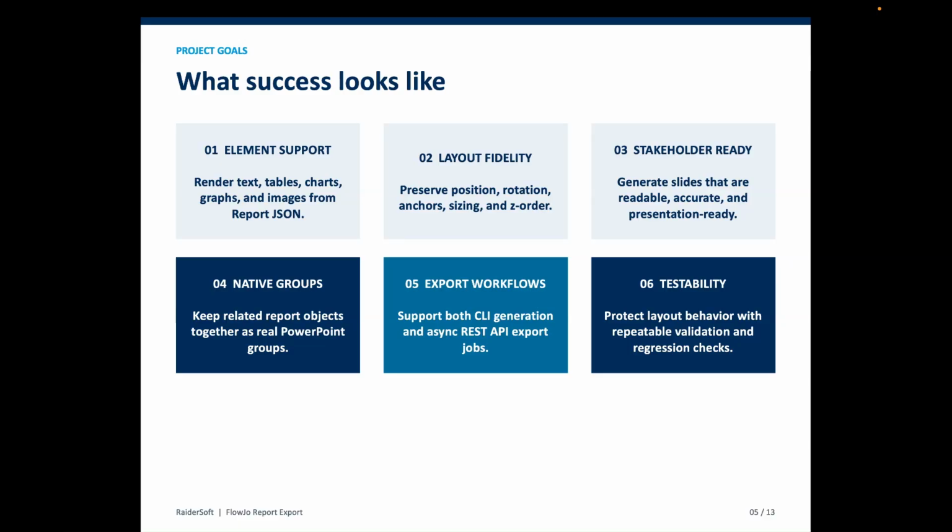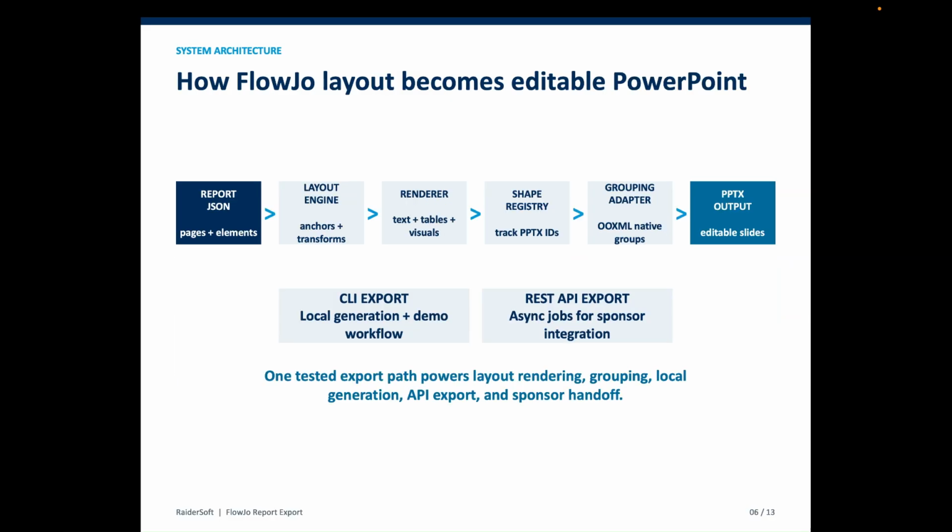Finally, we wanted this to work through both a local CLI workflow and a REST API, while also being testable so that future changes would not break layout behavior. Now we're going to go over the overall pipeline for how the report becomes an editable PowerPoint.